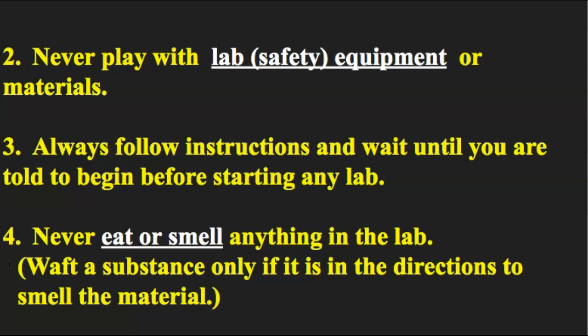Number 2, never play with lab or safety equipment or materials, especially if you haven't been told what we're doing with them. Some things look innocent, but they can actually hurt you.